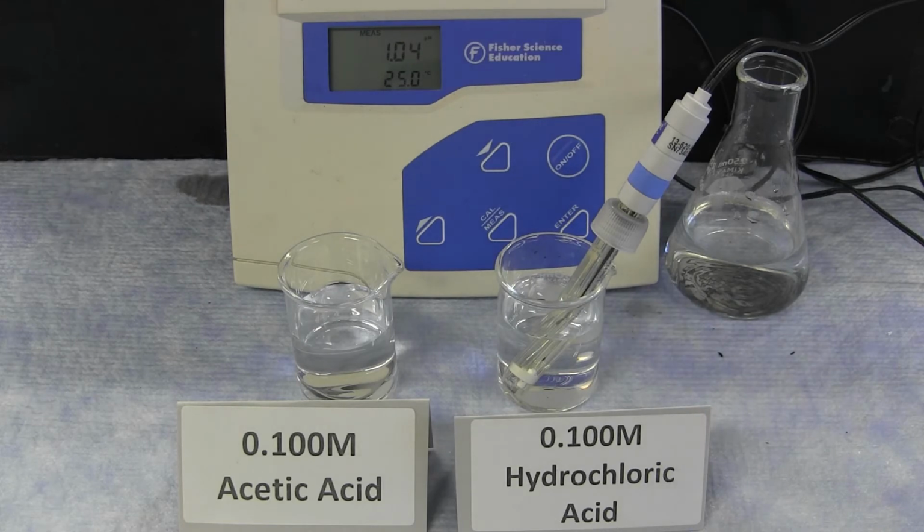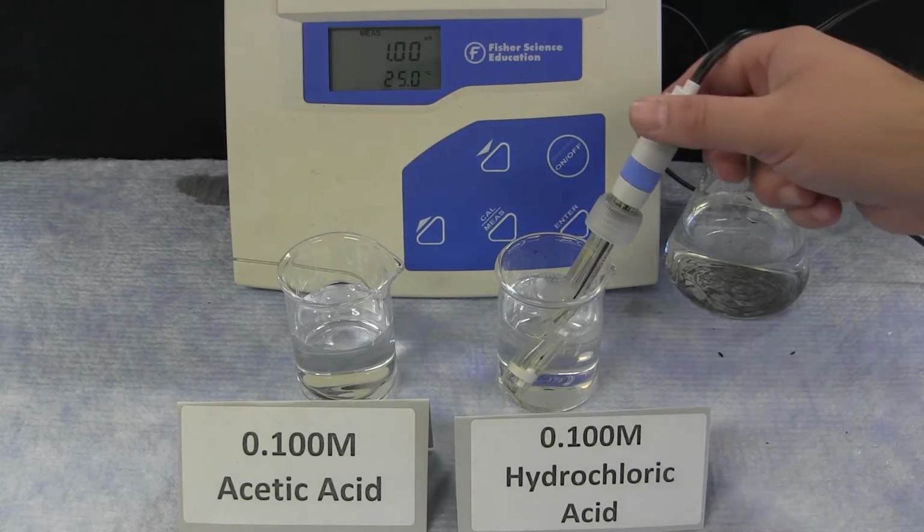With the accurate pH meter, when the pH of the hydrochloric acid solution is measured, the pH is near to 1 pH units, or 1.01 pH, or even exactly 1.